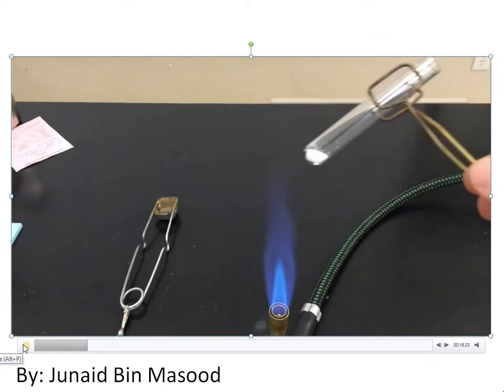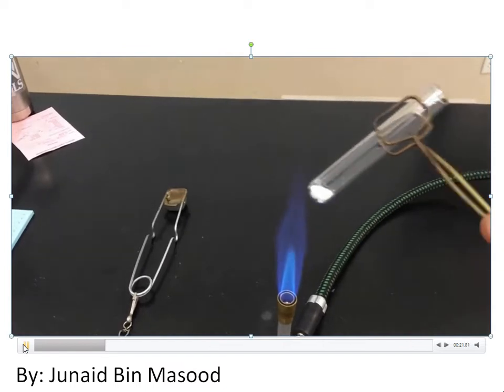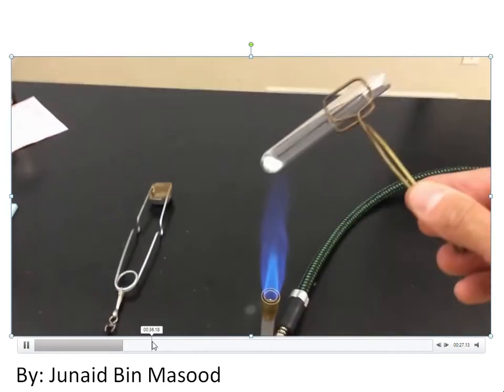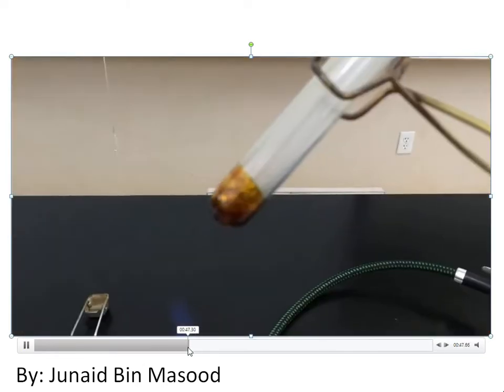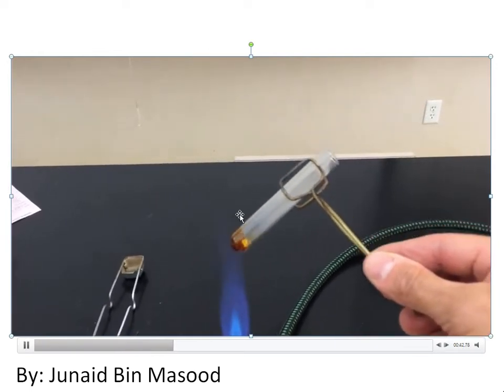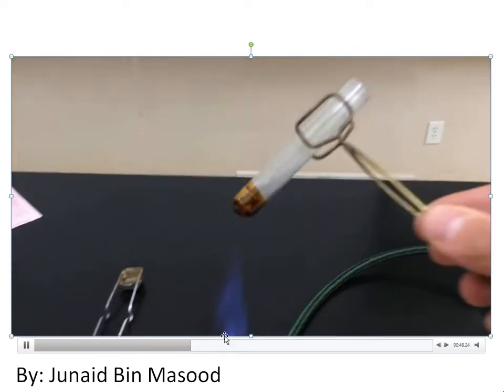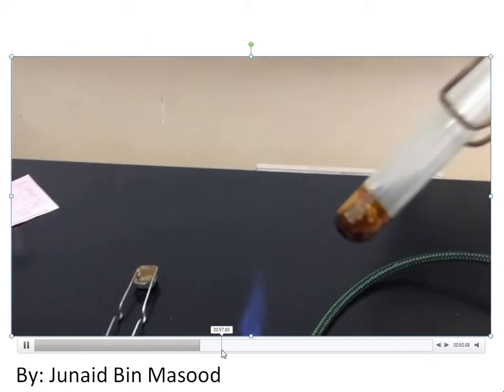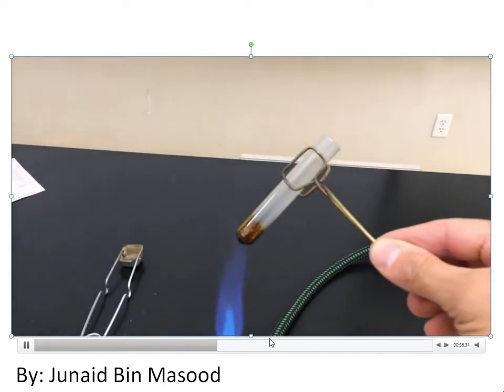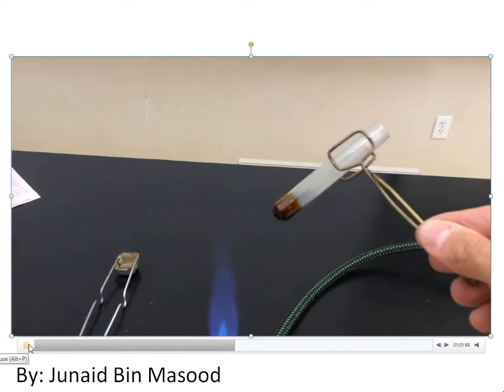I have white sugar, regular sugar that you use at home, and we are heating it, and as you're heating it you can see that once we forward, it's going to start converting, first into blackish, and then this is basically carbon and water, okay? So burning of sugar creates carbon and water, and you need to understand this experiment very carefully. You can watch the video as many times as you want, okay? So this is the burning of sugar.